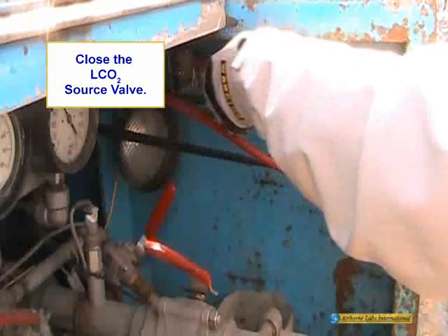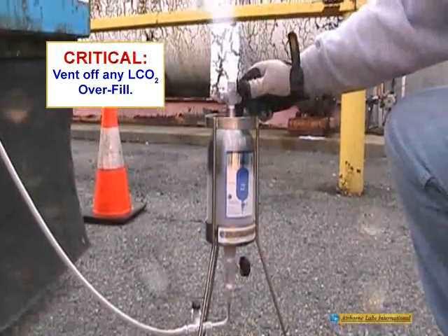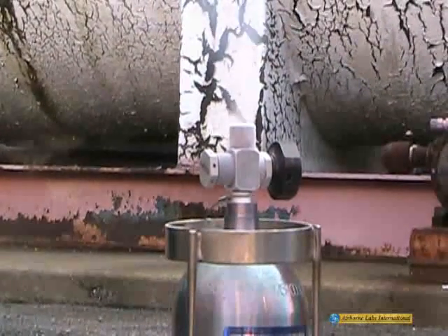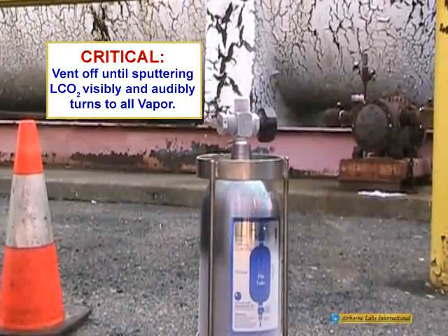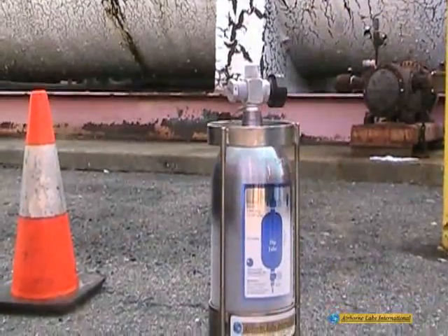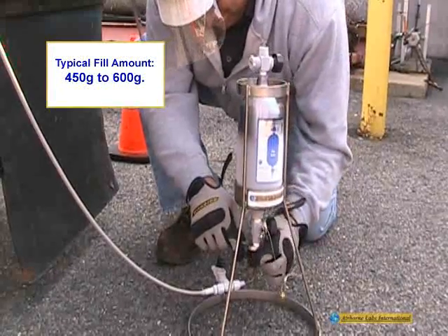Close the liquid CO2 source valve and allow the transfer line to completely depressurize with the purge valve open. Carefully open the top valve and vent off any liquid CO2 overfill as a sputtering snow stream. Continue to vent off any excess liquid CO2 until the snow stream visibly and audibly changes into vapor. Then close the cylinder outlet valve. The liquid CO2 fill will now be below the dip tube. In this state, a 1-liter cylinder contains a safe fill amount of liquid CO2 that is less than 68% of its water weight capacity. Typically, a 450 to 600 gram fill of liquid CO2 is achieved.